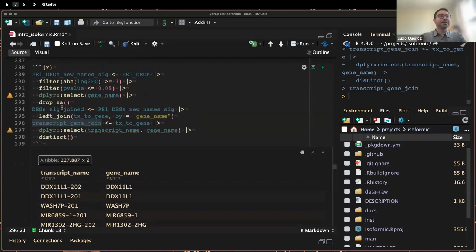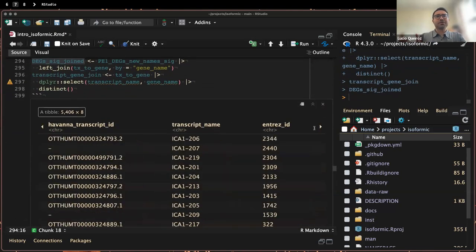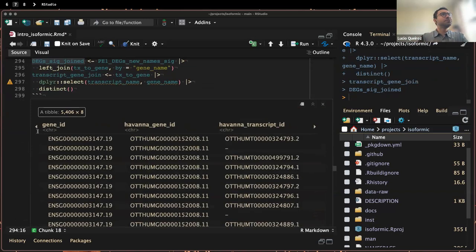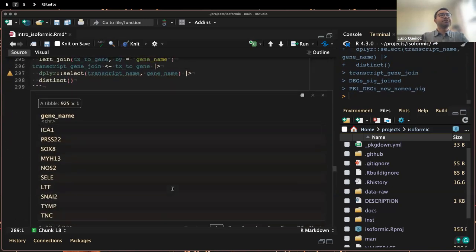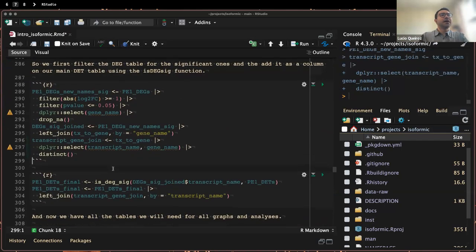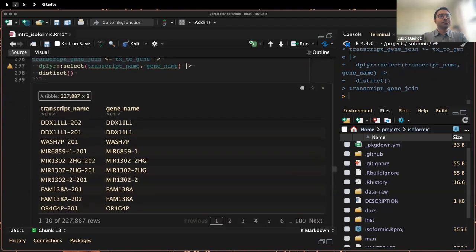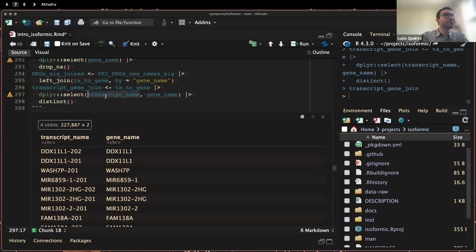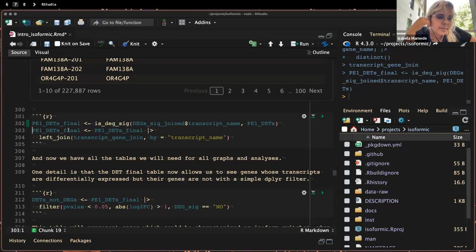Yes, exactly. And what's that? Yeah. And then in the end, like I said, here we are just working with the tables. And here you see that, no, not that one. What to do here? Here, that one. Here we have all the transcripts that were, no. Here are just the differentially expressed ones. So, no, not here. It's in the next chapter. Oh, it's the next one, yeah.